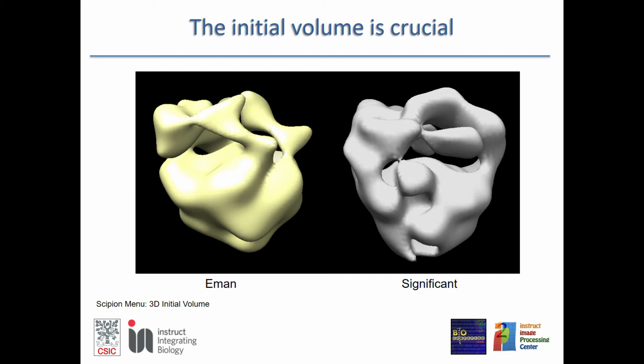And normally this is seen because the FSC of your 3D reconstruction doesn't go very far, but when you look at the 2D classes, you see very fine detail in the images. That means that there is good information in the images, but you have not been capable of incorporating it into the 3D.